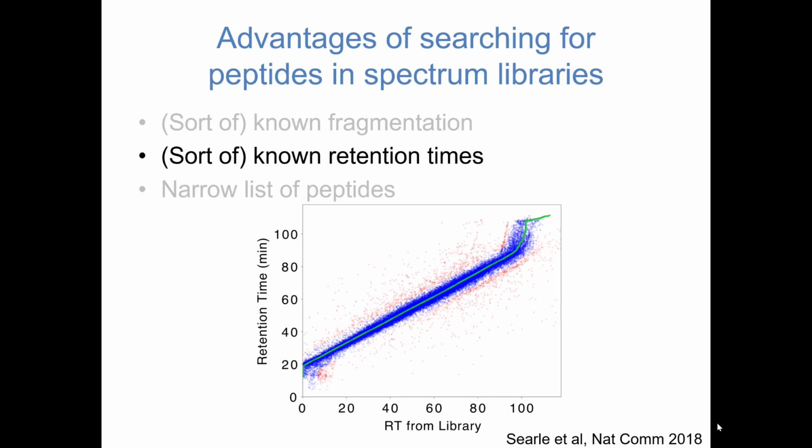Okay. So retention times are definitely a feature. Mostly they do give you maybe 10% of the range that you only need to extract out. That said, I would argue that retention time and precursor mass actually scale quite close together.